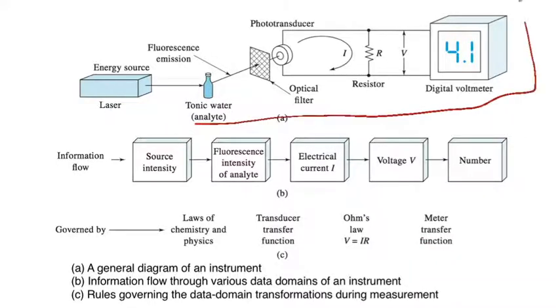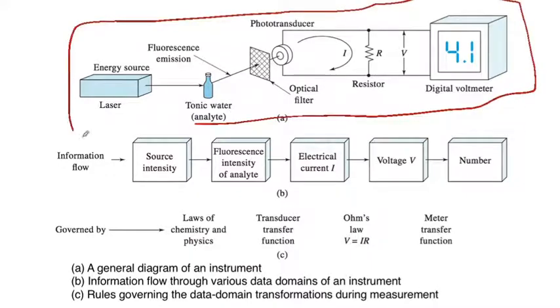Put a box around this. Everything inside this box is the instrument. So the probe is like the initial thing, the first unit. It's the thing that creates the response that we can actually measure. If there's no probe, then there's nothing happening.